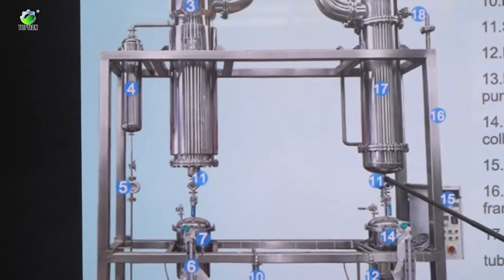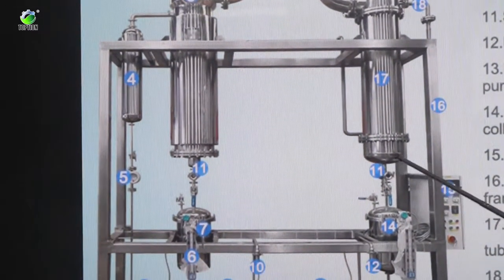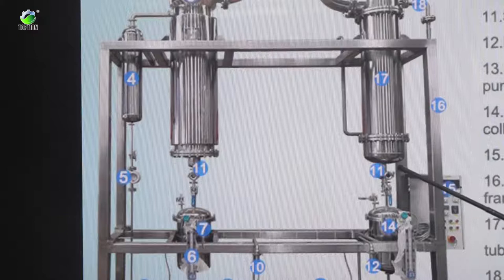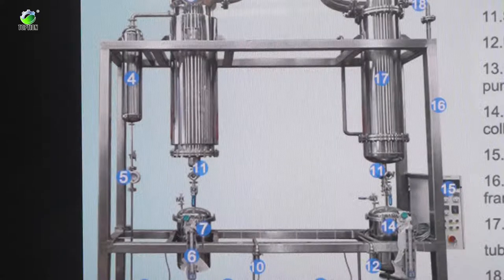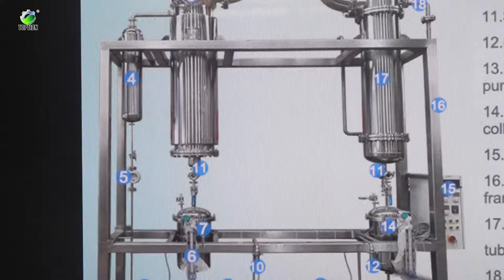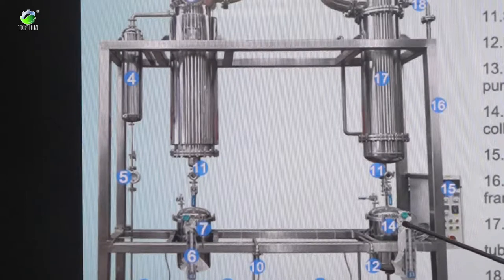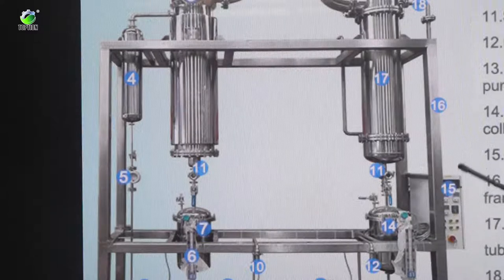And this eleventh is side glass. From the side glass you can see the liquid inside here. And the twelfth is ethanol outlet. And the thirteenth is explosion-proof gear pump. And here is the storage tank. Here is the controller for the whole system.